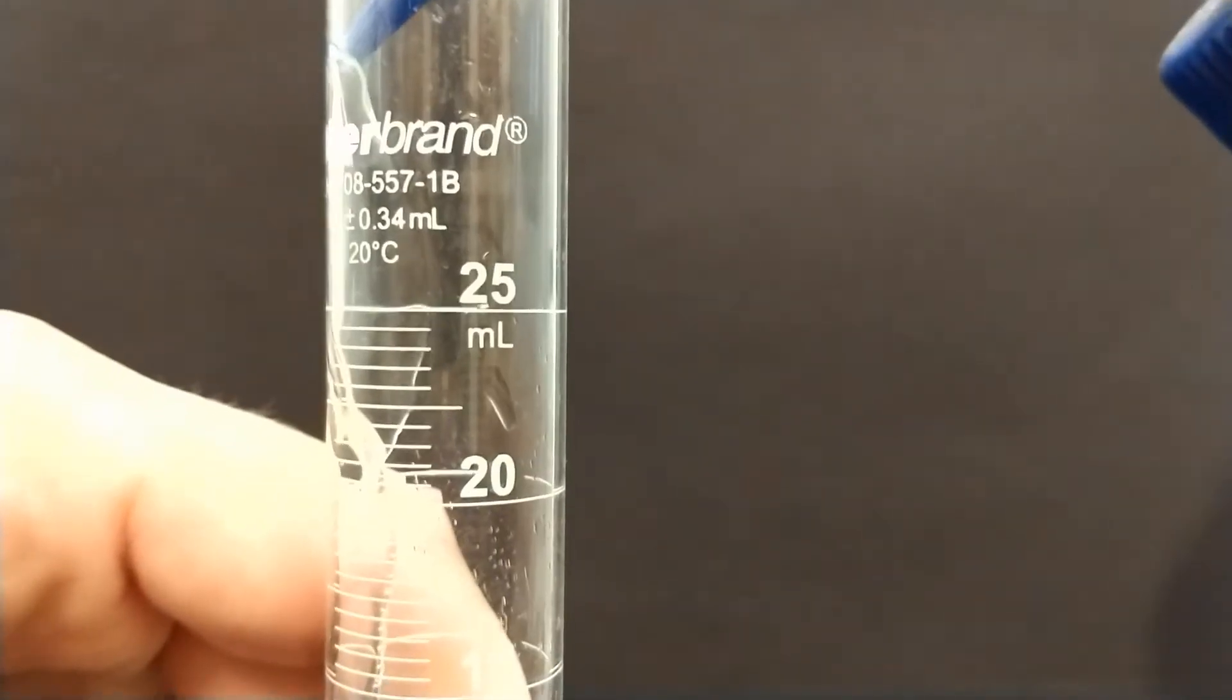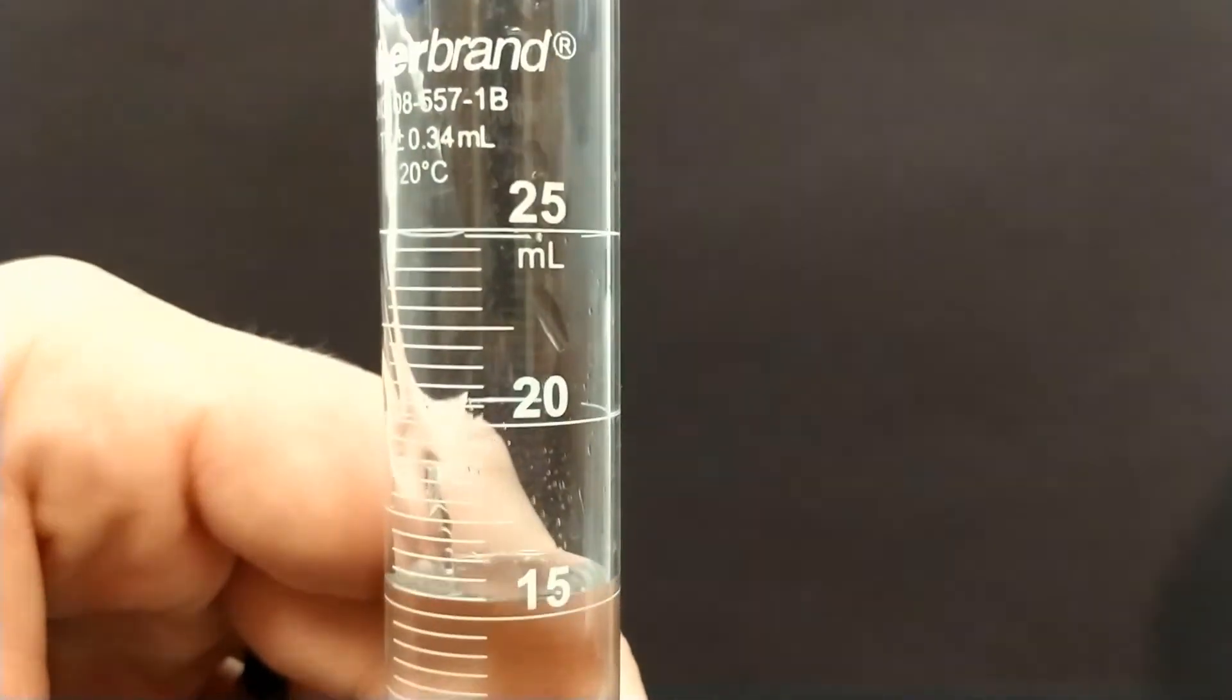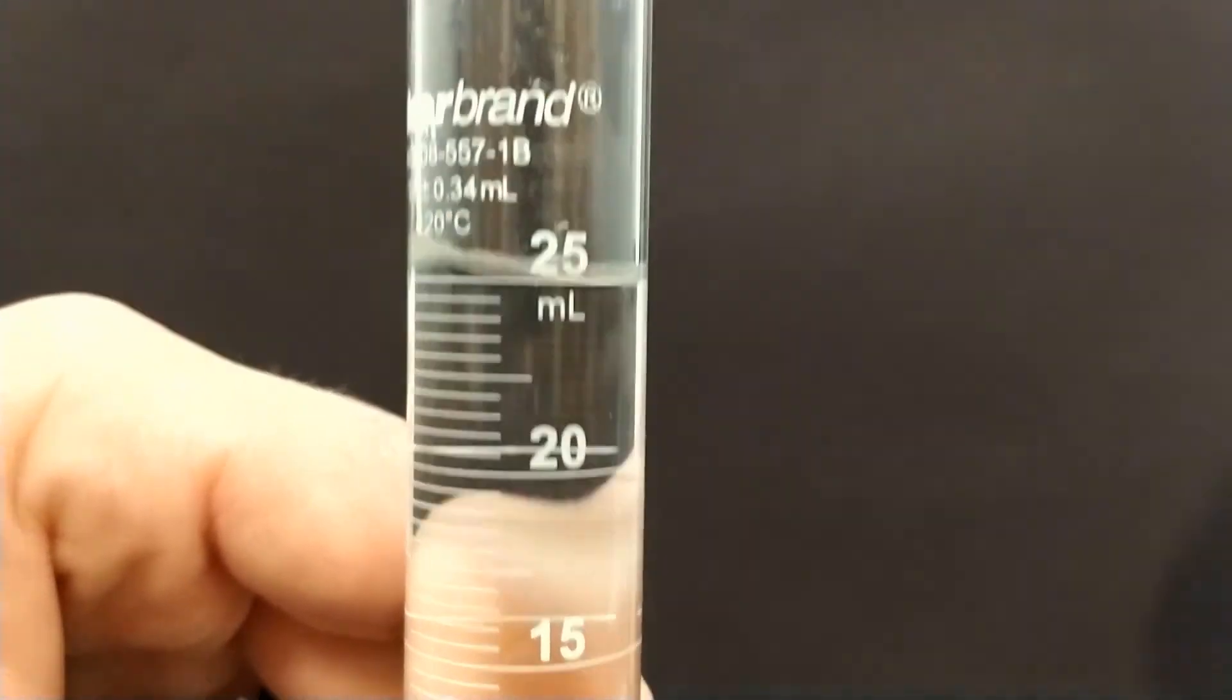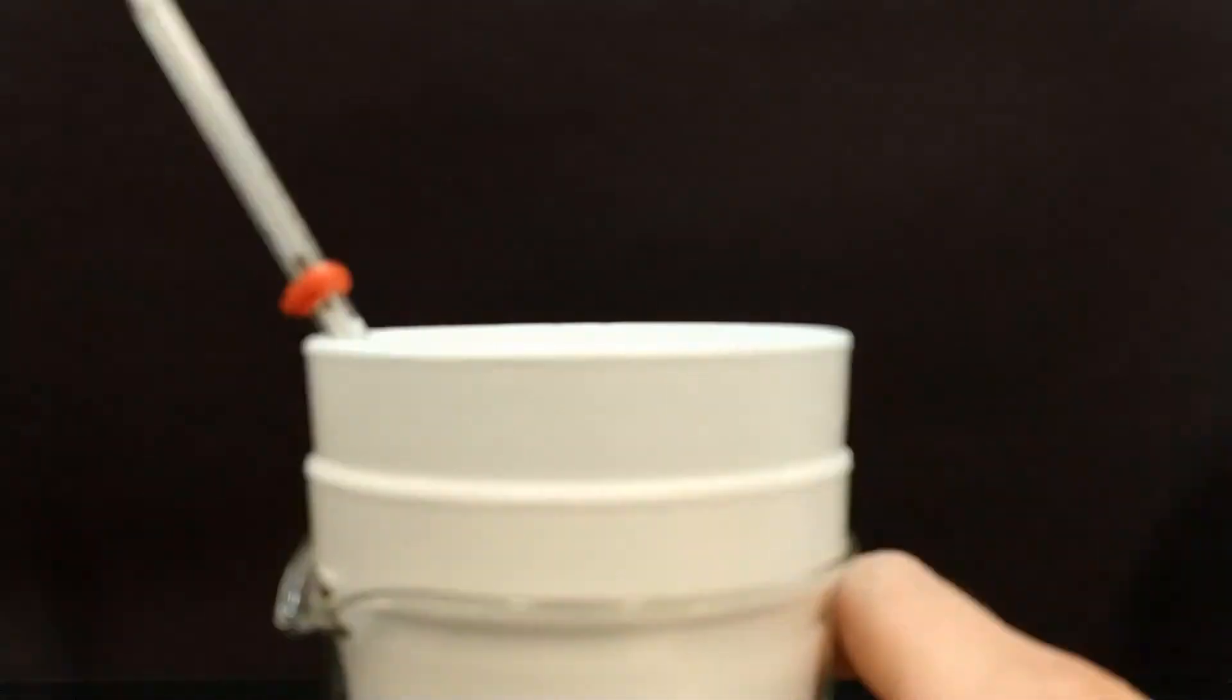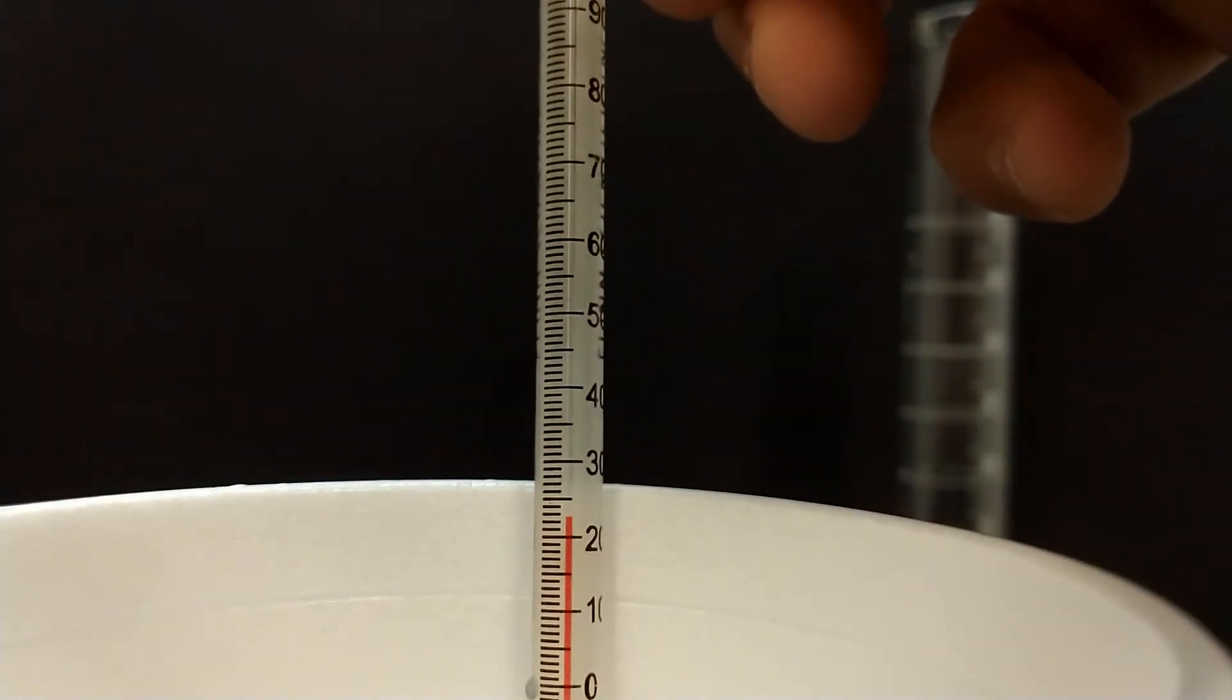The first step in this part will be to measure out 25 milliliters of distilled water into your calorimeter, and then you're going to want to record the temperature of that water in degrees Celsius. So measure out 25 milliliters, put it in your calorimeter, and record its initial temperature.